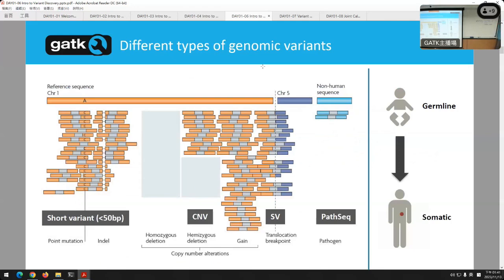The next category is an indel. It's an insertion or deletion, and usually it's a few bases that are extra or missing from your genome. They're usually small, maybe 1 base or 2 bases or 50 bases, but not more than that. When Emma talks about structural variation, she'll define it more there, but generally it's between 1 and 50 bases. Then you can get much larger structural changes in your genome.